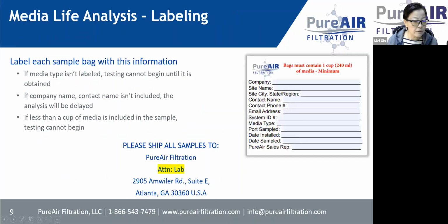Next I'm going to go over how the sample bag should be labeled, because we received hundreds of samples from different customer or different distributor, and one customer maybe have different locations and different system. So it's very critical we have a correct information logged into our system in order to give you feedback to project your media life.